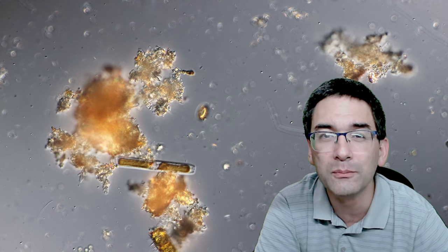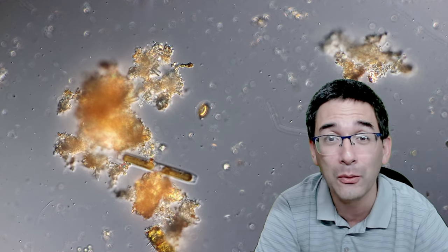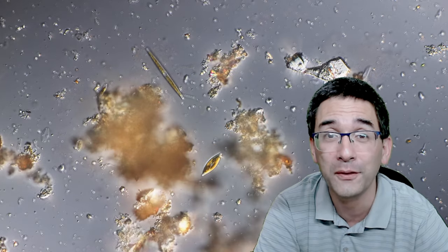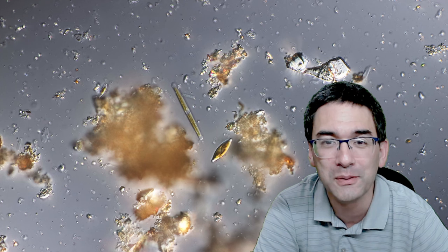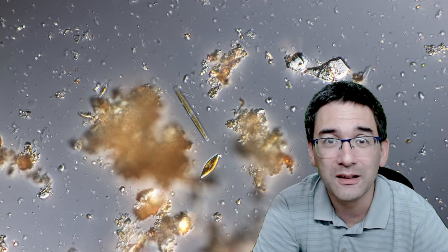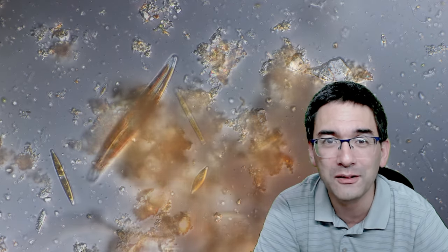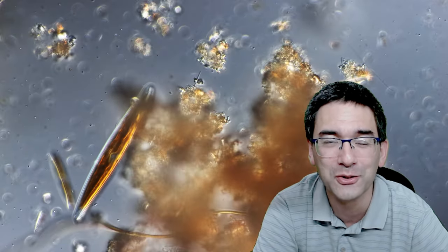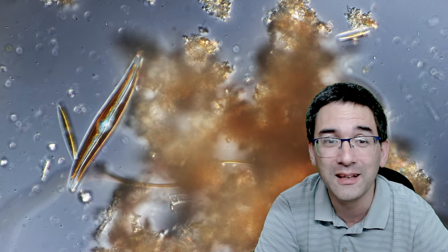So to make movement and motion visible, all you have to do is speed up the video or go up with the magnification, because then the motion and movement also becomes more visible. That's basically a little tip that I simply wanted to share with you. So don't be disappointed if the first impression is not very interesting, because sometimes there is much more going on than you might think.